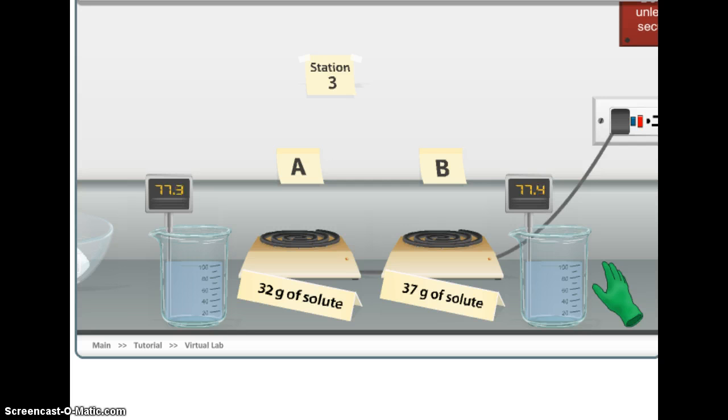What that means is it's going to look like little snowflakes are appearing on the side of the beaker. And what those snowflakes really are is the chemical. It's either the KCl or the KClO3, or maybe they are both KCl. Maybe they are both KClO3. We don't know. We call it an unknown in chemistry. And so we're working backwards to see, okay, what chemical did the chemist put in here? What chemical did the chemist put in here?